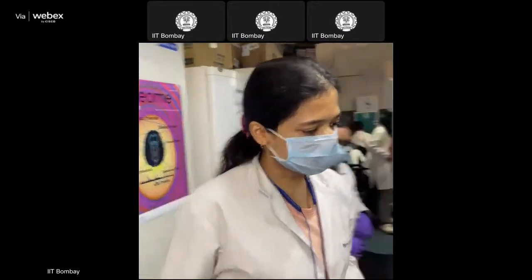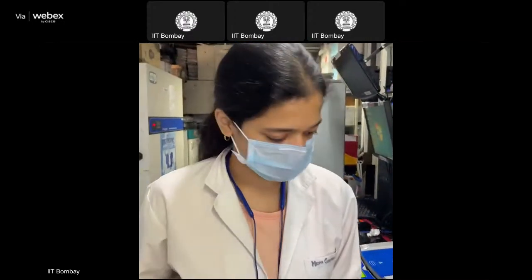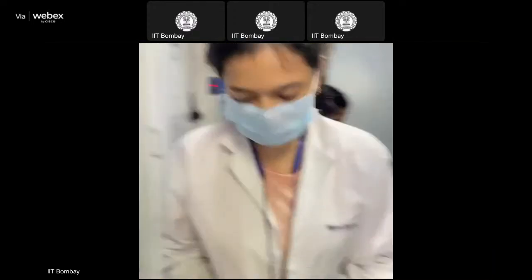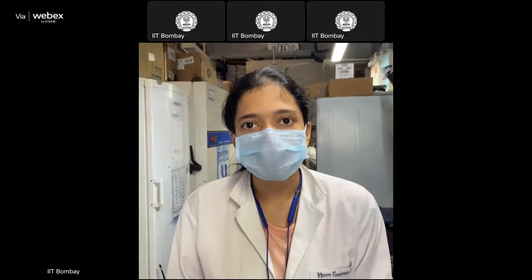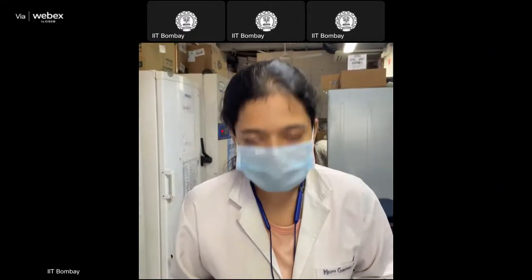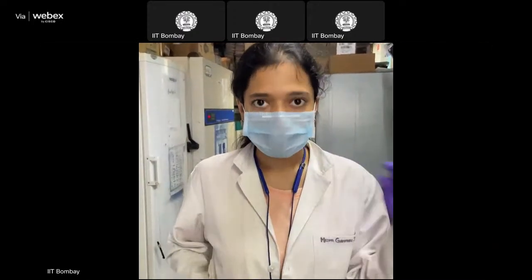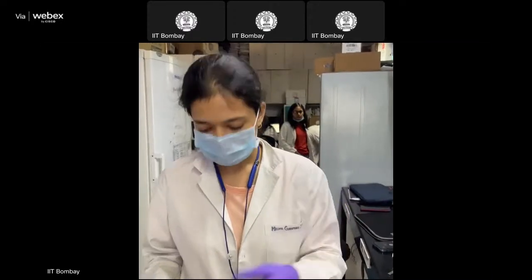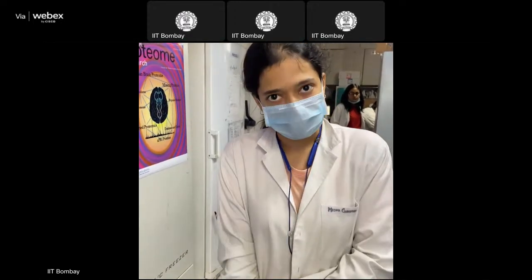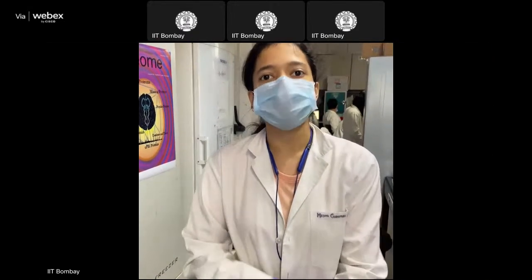Now that we have the peptides ready, our sample is ready to go. The last step is that we cannot simply give the sample to the mass spec. We need to first quantify how much we are giving, because there is a certain load that a column can take. Our instrument is an LCMS based setup, and every liquid chromatographic column has a maximum load. Whenever we are doing quantitative studies, we need to know how much sample we injected and how many peaks and how much protein we are getting for a given sample.